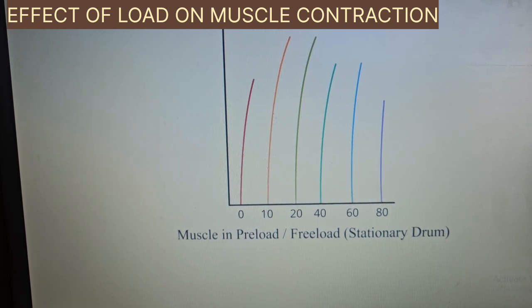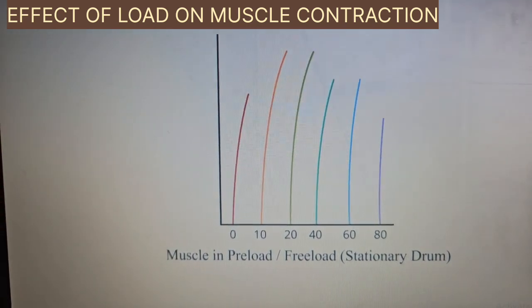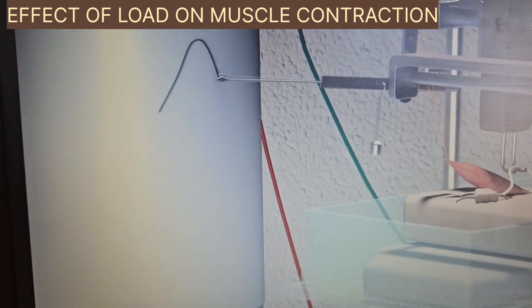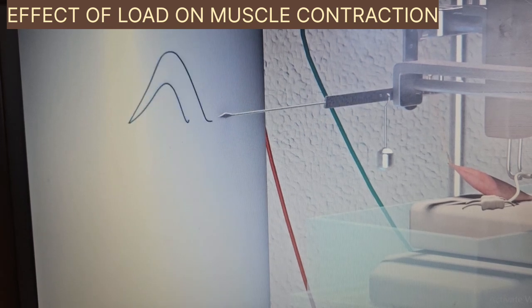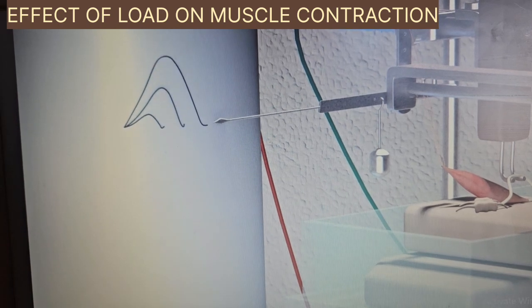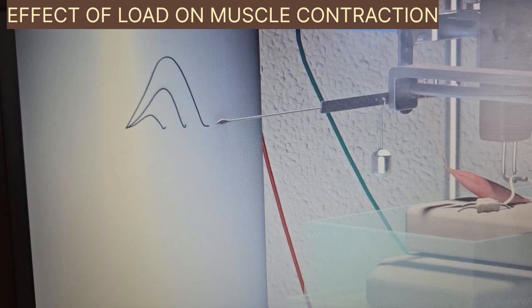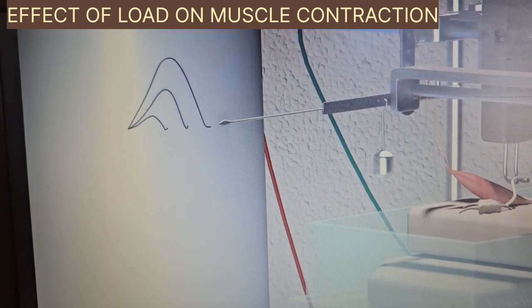Let us now discuss why this happens. In the afterload state, the muscle has to contract against the increasing weight. Hence, as the weight increases, the strength of contraction decreases. The latent period increases due to increased inertia of the lever because of the extra weight.